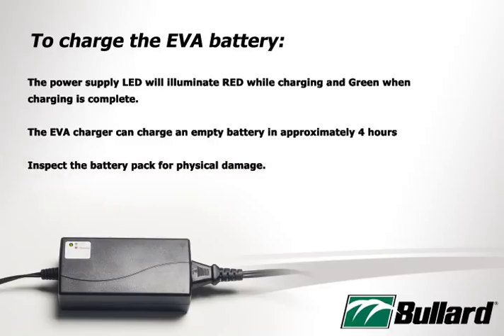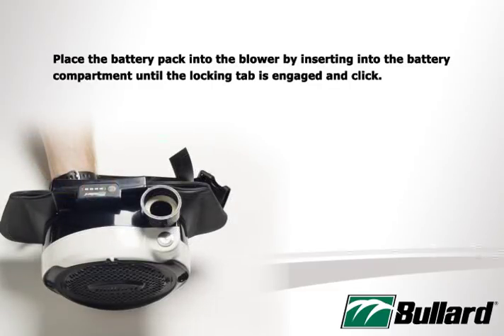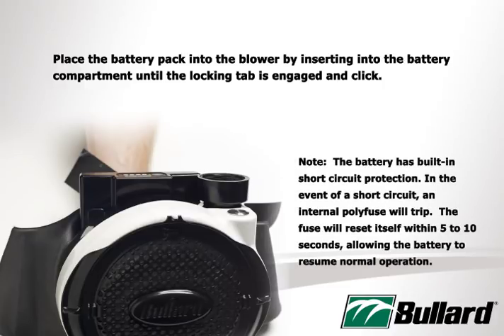The EVA charger can charge an empty battery in approximately 4 hours. You should always inspect the battery pack for physical damage. Place the battery pack into the blower by inserting it into the battery compartment until the locking tab is engaged and clicks. Note: the battery has a built-in short circuit protection. In the event of a short circuit, an internal polyfuse will trip. The fuse will reset itself within 5 to 10 seconds, allowing the battery to resume normal operation.